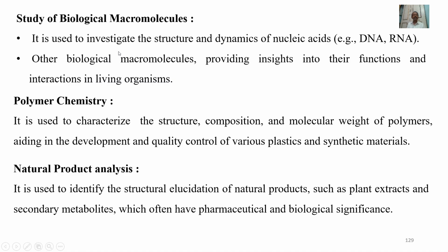It is used to investigate the structure and dynamics of nucleic acids, DNA and RNA, and other biological macromolecules, providing insights into their functions and interactions in living organisms. Polymer chemistry. It is used to characterize the structure, composition, and molecular weight of polymers, aiding in the development and quality control of various plastics and synthetic materials.